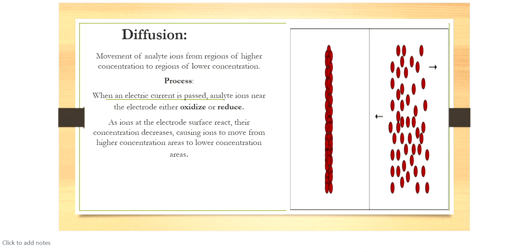So at the electrodes, we see that there is a reduction happening. That's why near the electrodes, the analytes gain electrons. So this will reduce the concentration at the electrode. That's why the mass will be transferred from the bulk solution to the electrodes. In this way, diffusion mass transfer will take place in the electrochemical cells.